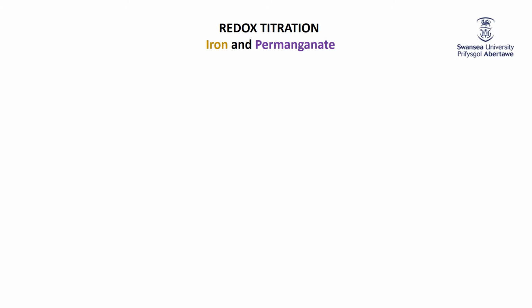This is an online contest designed to temporarily replace what we would normally do when there's not a global pandemic going on, and that is to invite teams of 3 year 12 students to come to our lab and do 2 analytical chemistry experiments. Doing it online this year, I've got 2 experiments for you. You can do one, you can do both, whichever your teachers or you want to do.